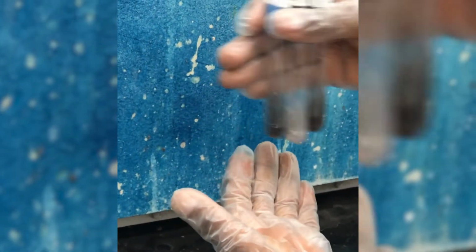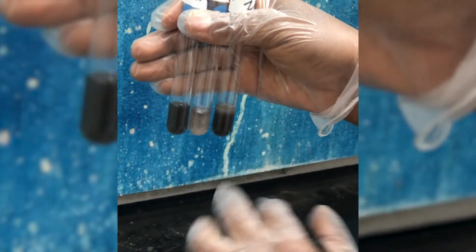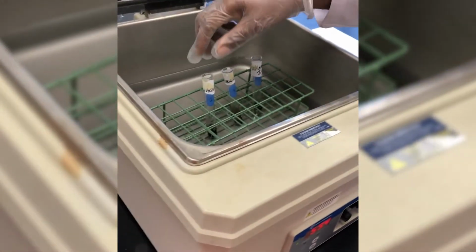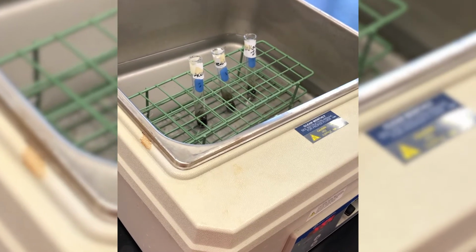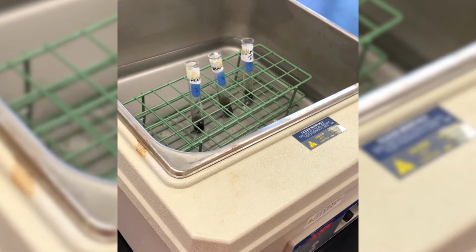So we're going to transfer this into 6. Don't make your conclusion. You can come up with your observation at this time, but don't make your conclusion until after we have put this in a hot water bath at 60 degrees for 5 minutes. So this is still the Tollens test that is supposed to help us distinguish whether we have an aldehyde or a ketone functional group in our unknown.